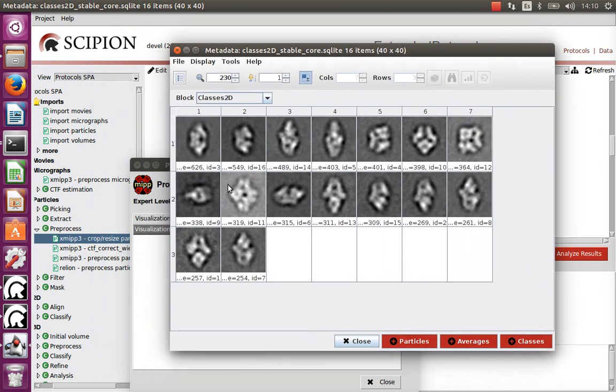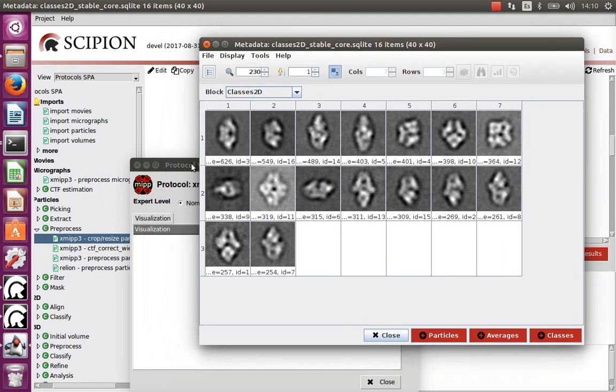The good thing about RELION is that it separates garbage images into separate classes, but mixes good images together. This is compensated by CL2D, which is the opposite: CL2D gives very good class coverage but distributes garbage images across all classes. Using one after the other is therefore a good combination.